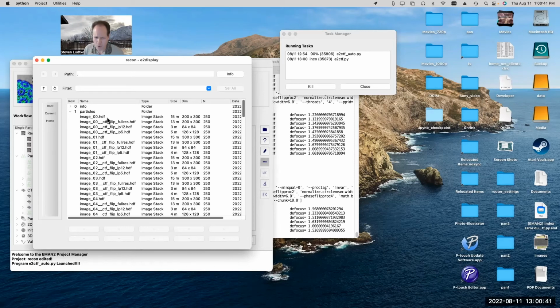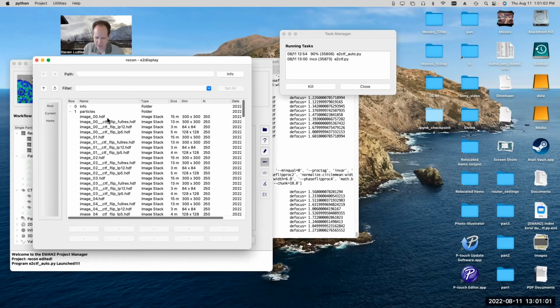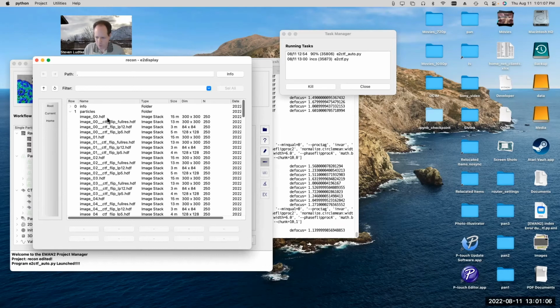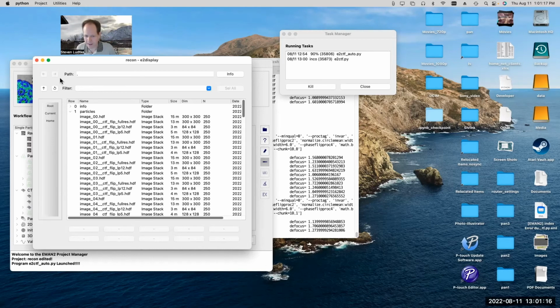Now, when you're really pushing the resolution, past 2 angstroms, you start having to think about per particle defocus correction. But that's not something that you handle at this stage. That gets handled during the refinement stage, where the defocus values for individual particles might get tweaked. If you do that in the canonical way, where you flip the phases once you've determined the defocus here in EMAN, then you have to unflip the phases and then flip them again with the correct defocus, something like that.